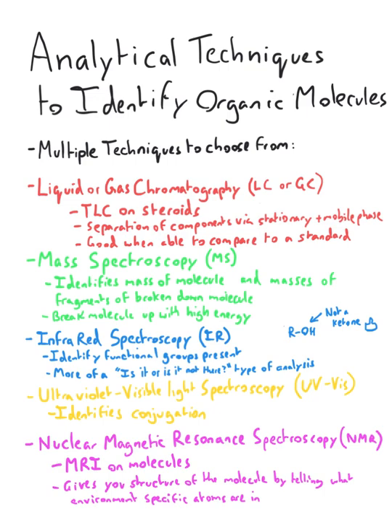However, even NMR is not perfect, and usually you need to combine multiple of these methods to be able to characterize an unknown compound. What do we mean by characterize? We mean by identifying the unknown. So if I gave you a vial of a clear liquid, you would have to combine multiple of these methods to be able to identify what it is.